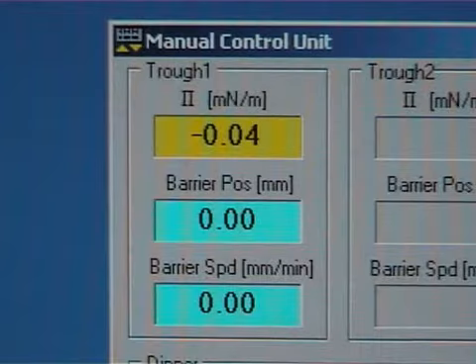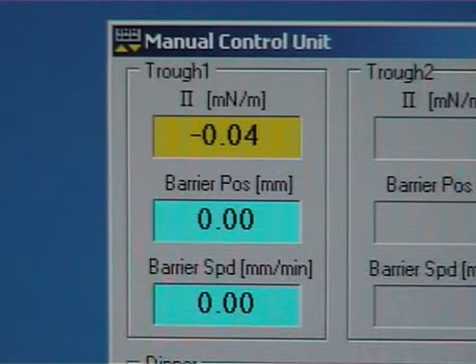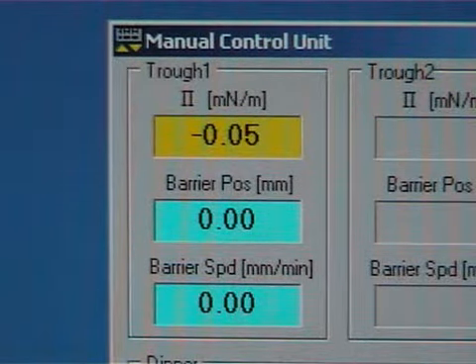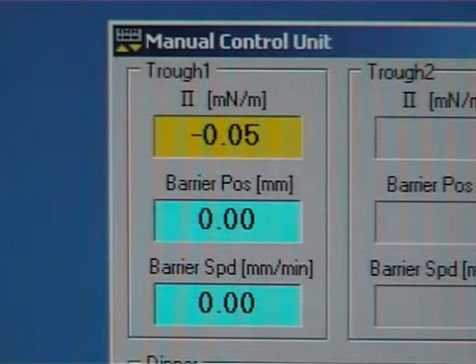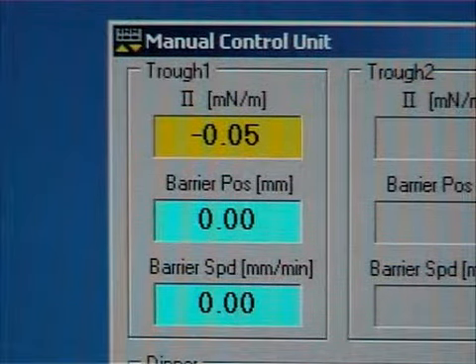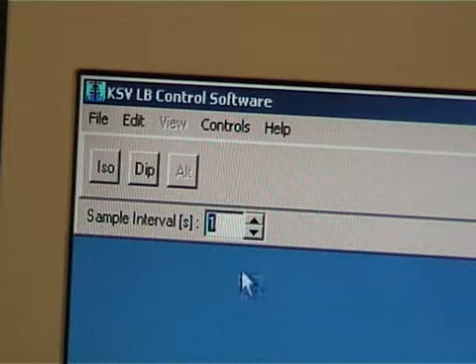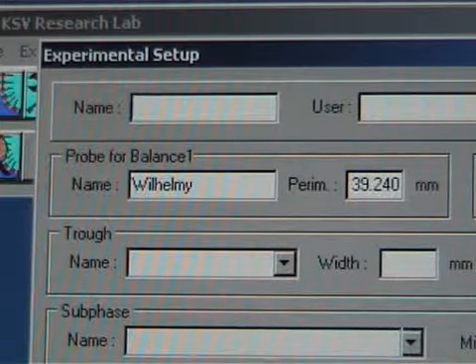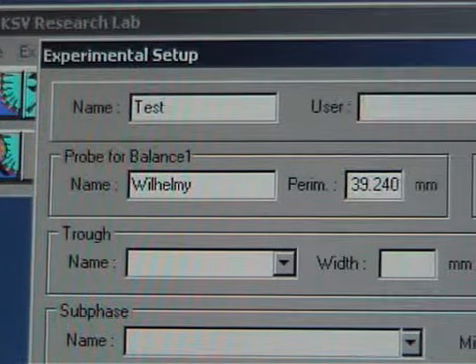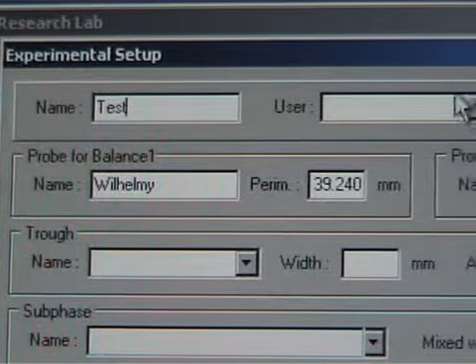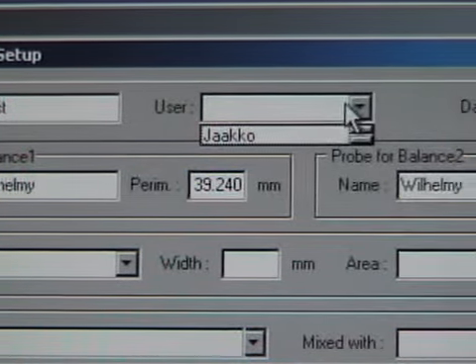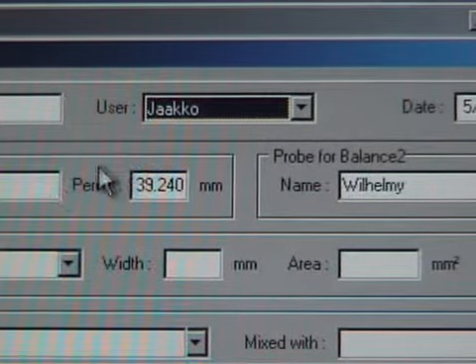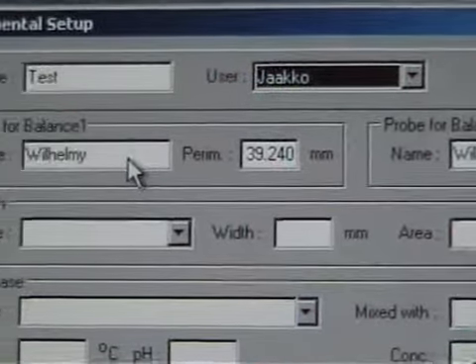It's good to check that the balance value is still close to zero and the surface is still clean. Open the LB control software and choose the dip icon. Certain information is required in the experimental setup before a new measurement can be started. Type in the measurement name, choose the user and choose the right trough, which in this case is named mini.